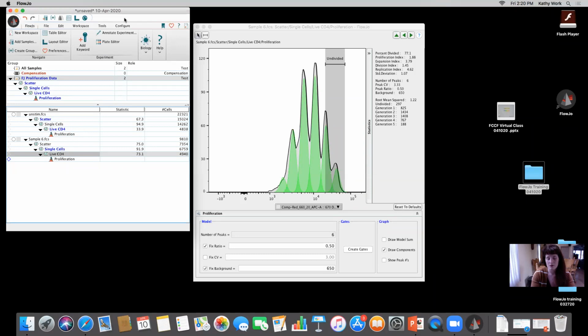What I'd first suggest is to see if maybe another modeling platform pulls it out a little bit better, or try and optimize the assay a little bit via titration of the dye to pull it out. Right. So it's very important that when your data doesn't look good, and this is assuming that you've done everything correctly, sometimes biologically you just don't get those nicer CVs like you're seeing here.